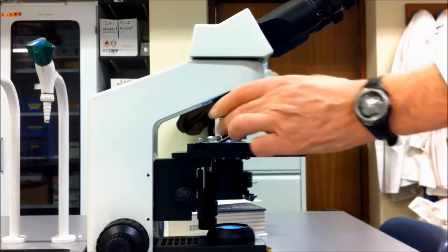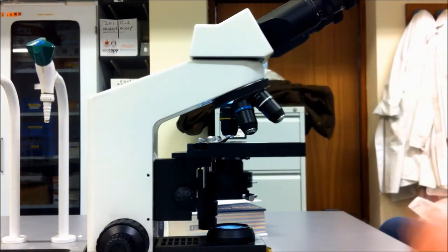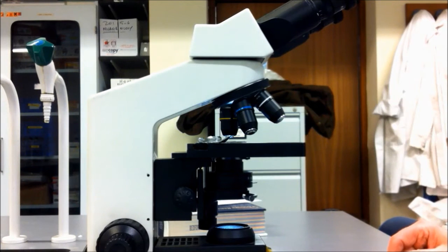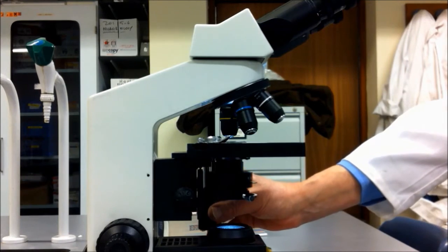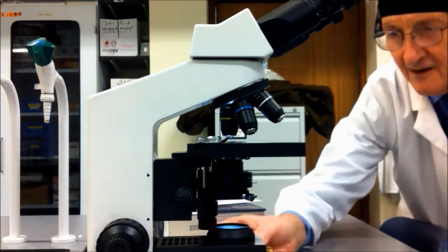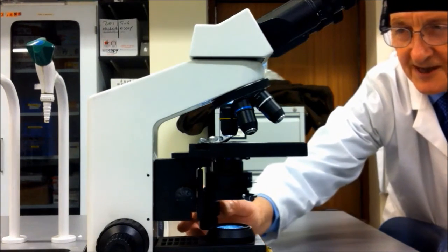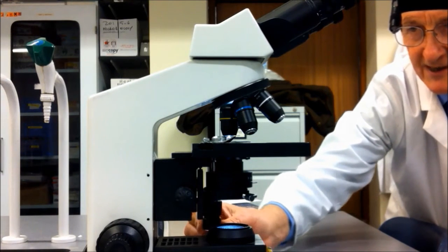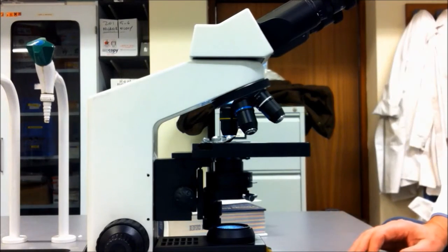When you're using this, it's usually best to start with 100 times magnification, with that lens pointing straight down at the stage. The stage is where you're going to put the microscope slide. On the side there is a control which enables you to move the stage backwards and forwards and side to side, so no more fiddling about with microscope slides.